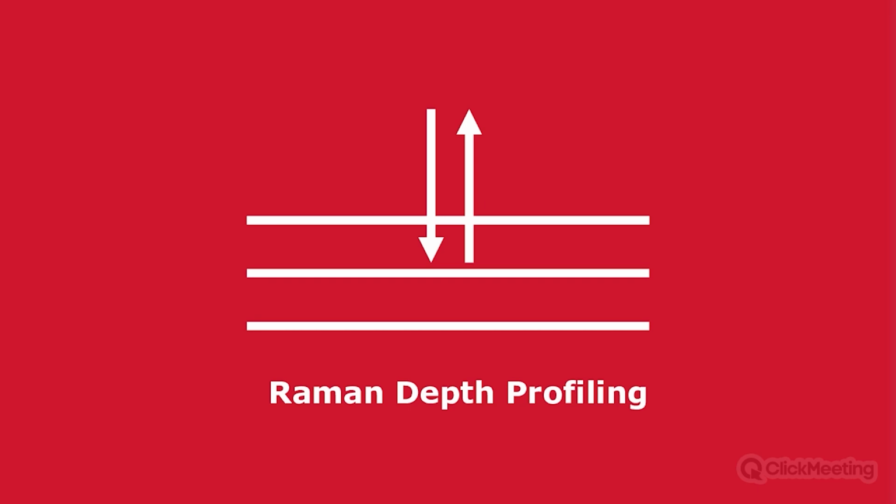I now move on to a different application area, which is now moving away from nanomaterials to looking at bulk materials and how Raman can be used to investigate the change in material properties as a function of depth through the sample.